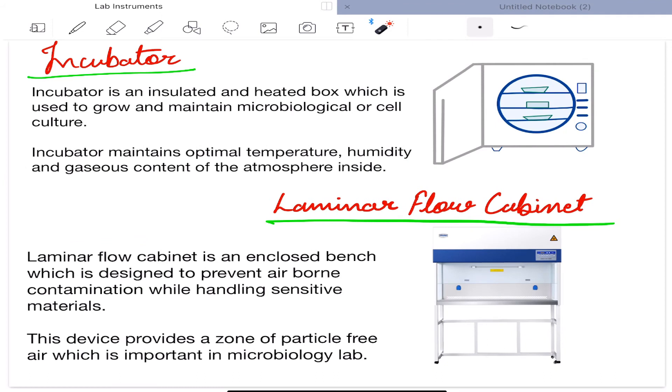Next is incubator. Incubator is an insulated and heated box which is used to grow and maintain microbiological or cell culture. Incubator maintains optimal temperature, humidity, and gaseous content of the atmosphere inside.